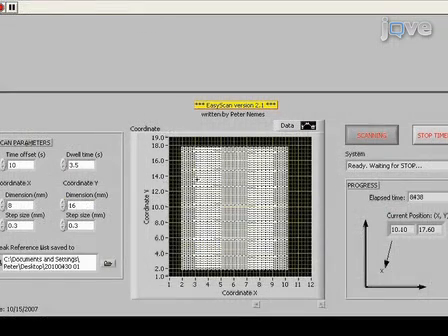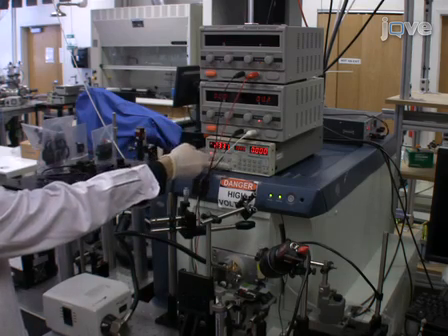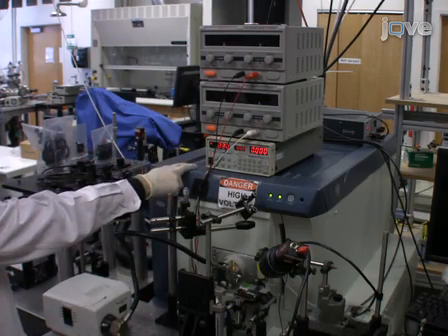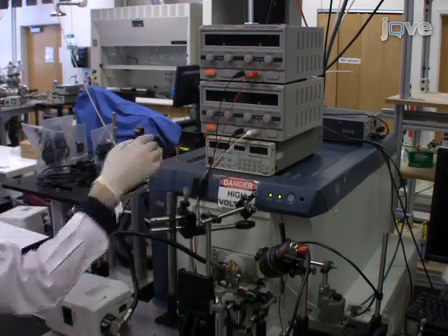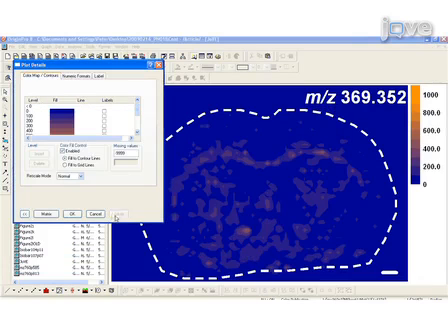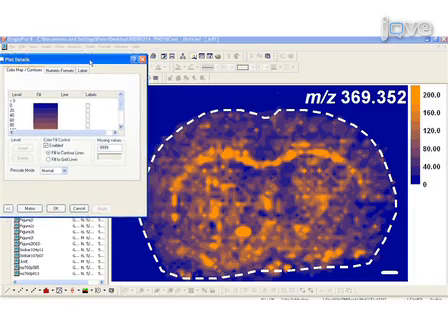When the imaging run has finished, stop the surface scanning, the mid-IR laser, and the data acquisition. Disable the laser source, turn off the high voltage, switch off the syringe pump, and set the mass spectrometer to standby mode. Also turn off the Peltier cooling electronics and close the inert gas flow if used. Finally, plot the ion intensity signal for a selected m/z value against the absolute coordinates of analysis to obtain lateral or 3D molecular images.